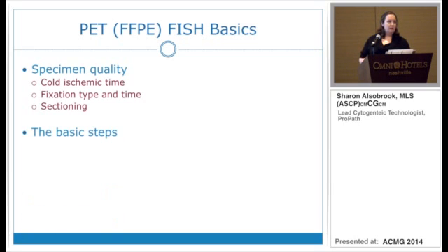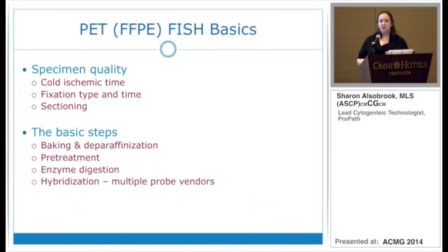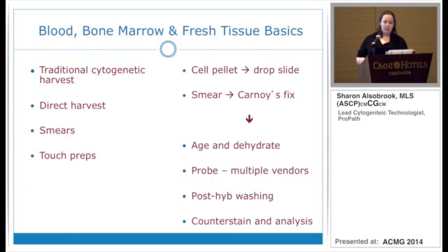In the basic steps of PET FISH, paraffin-embedded FISH, you have to obviously cut the slides, section them, deparaffinize. Then you're going to have to go through a series of steps. Pre-treatment, a digestion, usually pepsin or protease. Then you have to apply your probe, hybridize. There's a stringent post-hybridization wash, counterstain, and analysis. Now, all this comes together, blood and bone marrows and tissues.